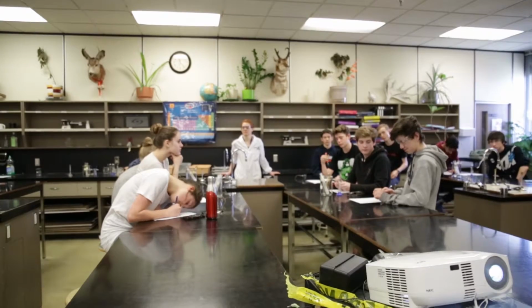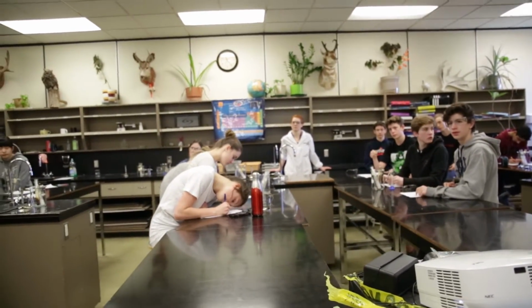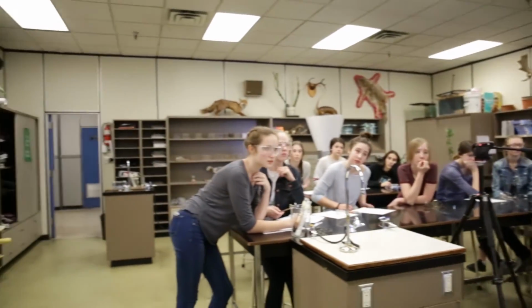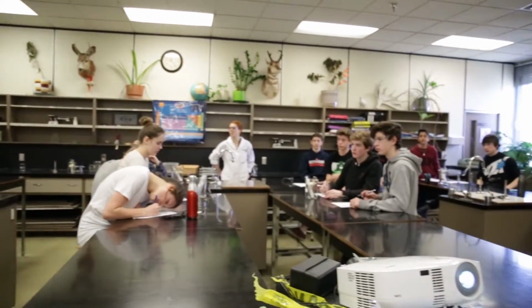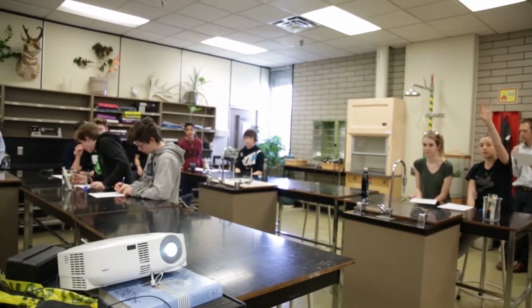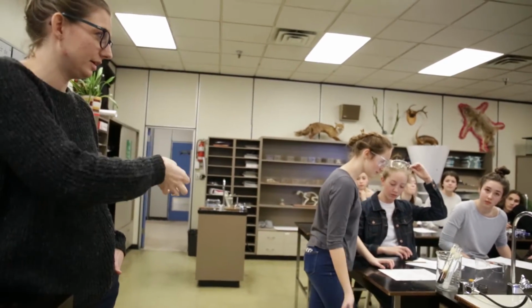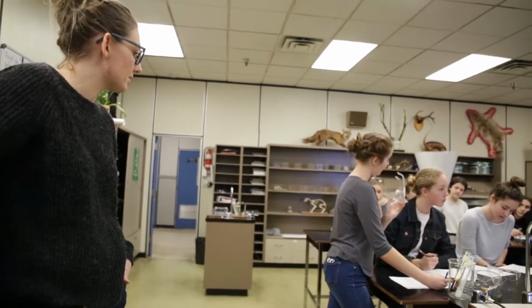Good. I noticed that some people were making observations about how test tube B was boiling. Was it boiling similarly or different? Yeah, Anthony. It exploded? That's what A did for us. So we found that A did nothing bad for us. B... Okay, so Emily was noticing rings on test tube B that were kind of floating up. Okay, so that definitely has to do with the substance that was in it.